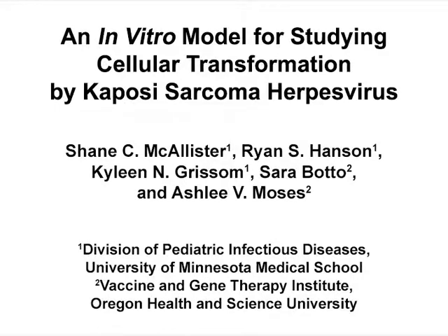The overall goal of this procedure is to prepare age and passage-matched mock and KSHV infected endothelial cells to enable the study of KSHV-associated changes in host cell gene expression, including alterations driving malignant transformation in the context of appropriate controls. This method can help define the key pathophysiological changes in host cell biology that lead to KSHV-associated cancers, thus identifying novel therapeutic targets for disease prevention or treatment.